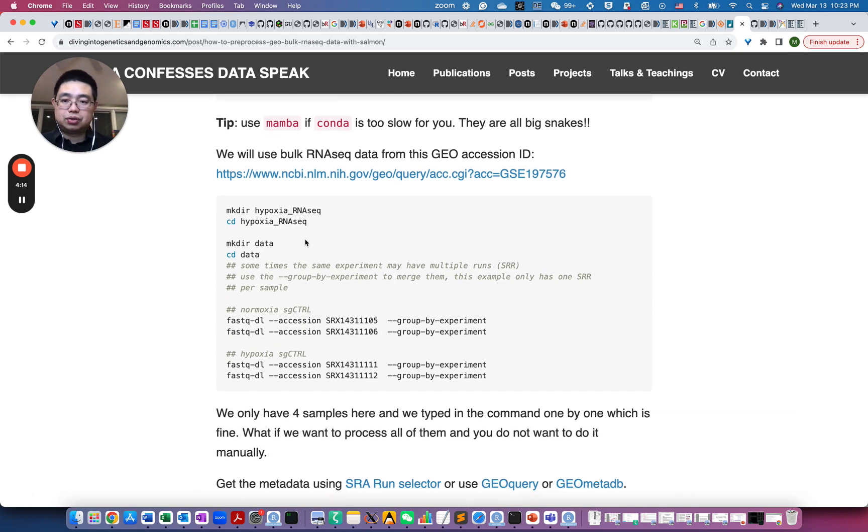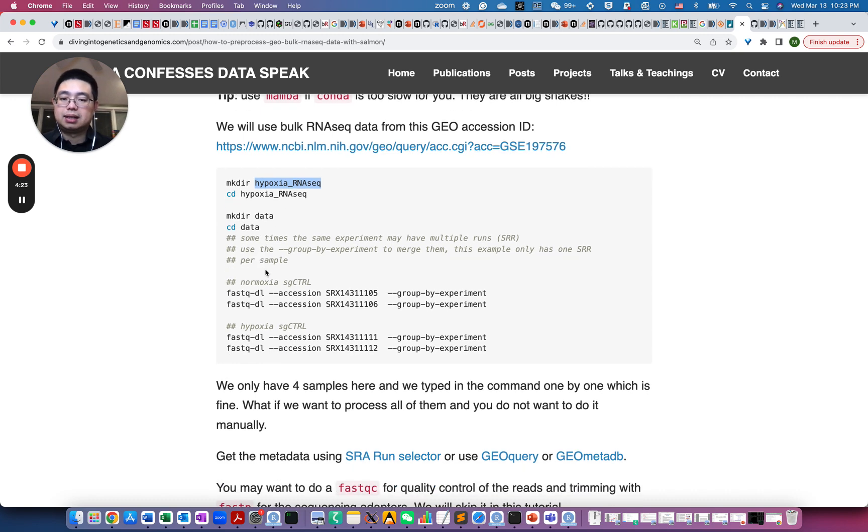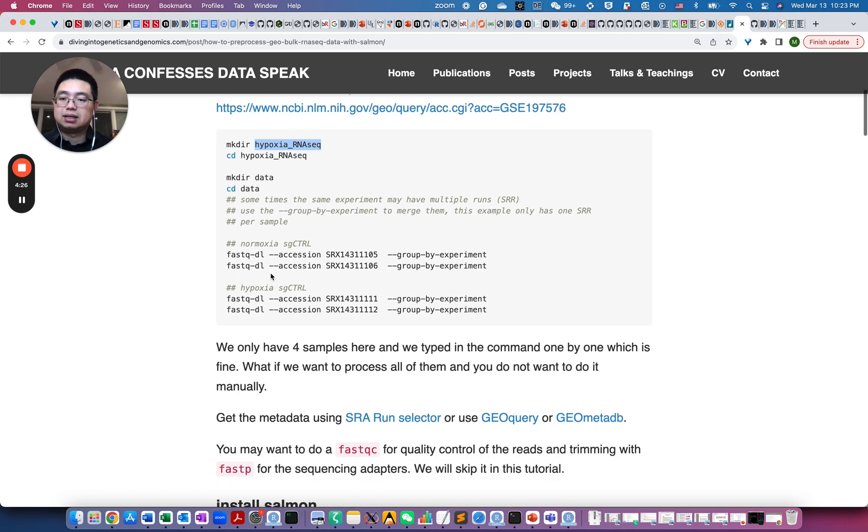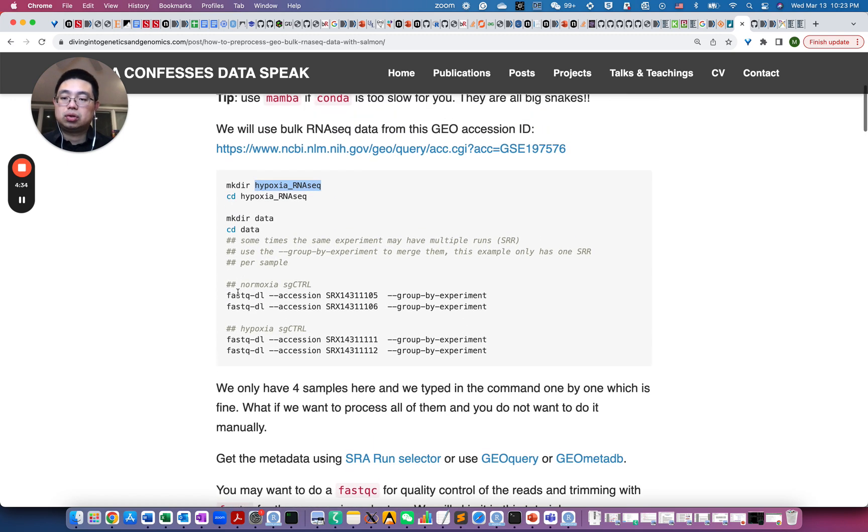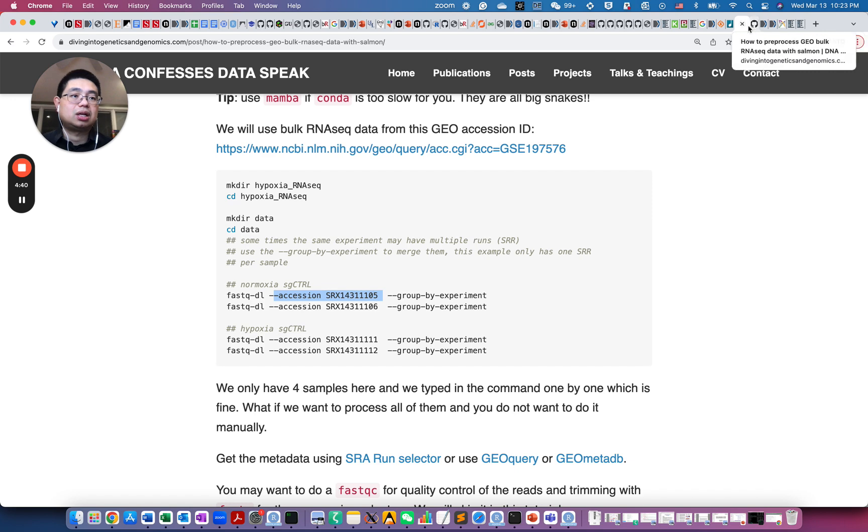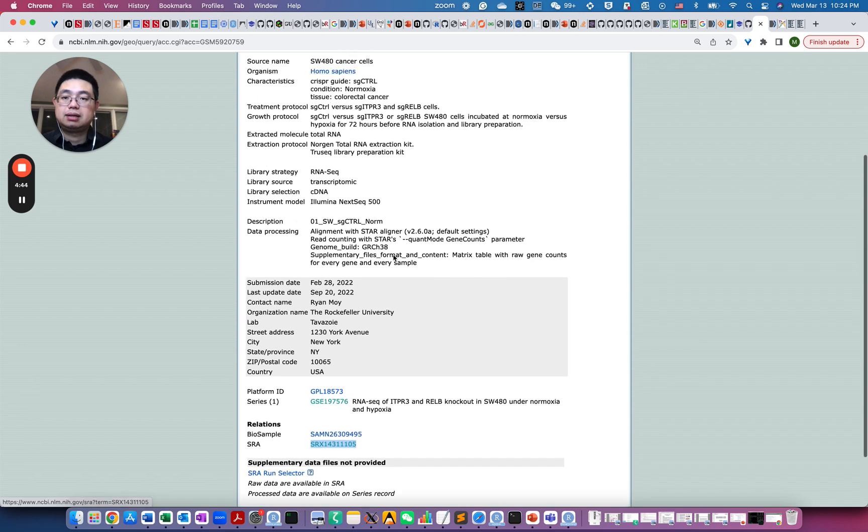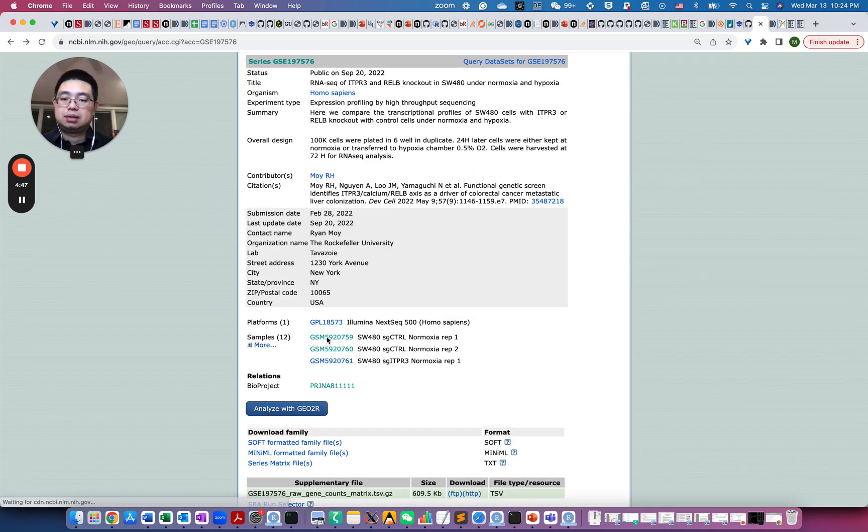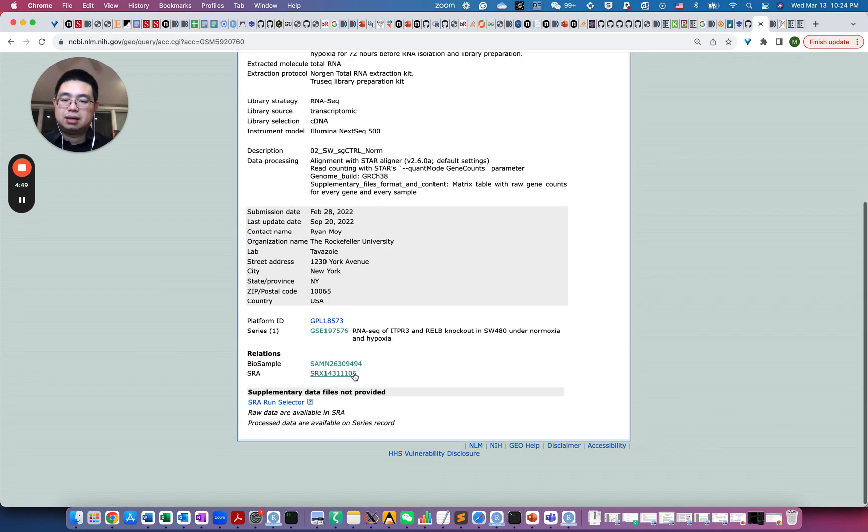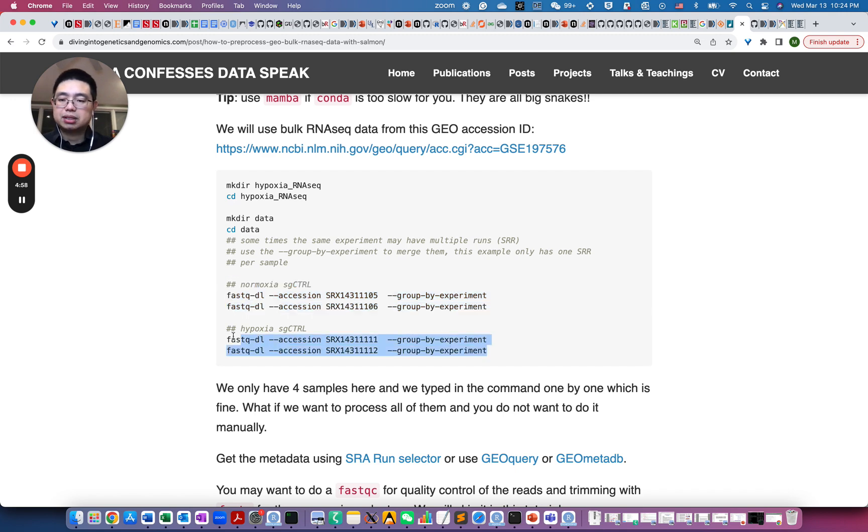So to do this, we first make a directory, hypoxia RNA sequencing, then go to that folder and then make a new folder called data. And then you can download the data, the FASTQ files into that data folder. So once you install the FASTQ-DL, then you can do a FASTQ-DL and then you can provide accession number. So the accession number, if you go here, essentially is this number. So for every sample here, you can find the SRX number. So essentially those are the four samples here, normoxia condition and hypoxia condition.